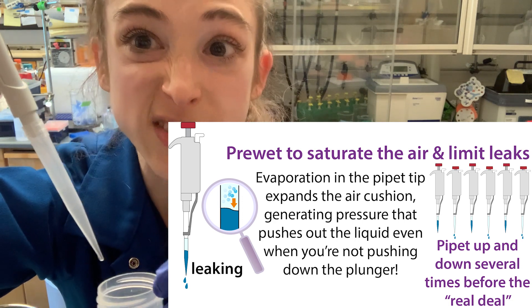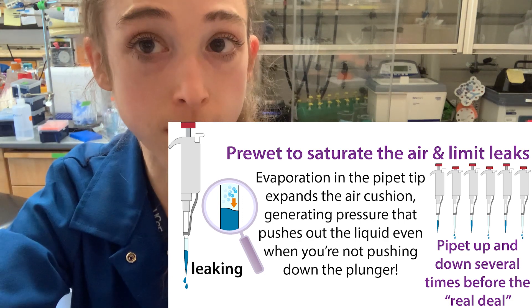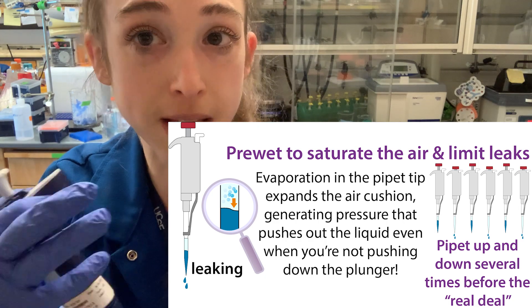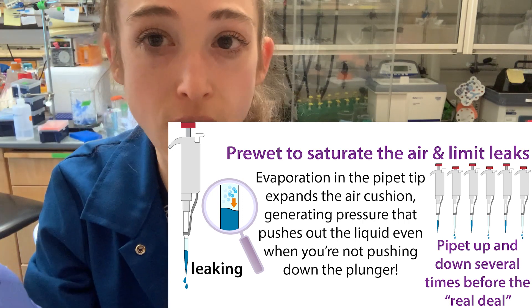You are going to have to do some extra work — it's going to take longer because you have to pipette up and down a few times before your sample. If you're pipetting a small volume and you need to pre-wet, you can pre-wet with a larger volume. That's going to make it easier to equilibrate and saturate the air cushion than if you were just pipetting up and down a couple microliters of ethanol.